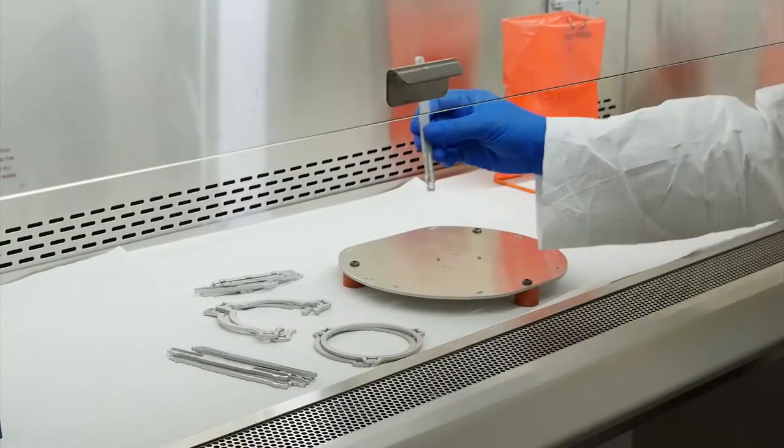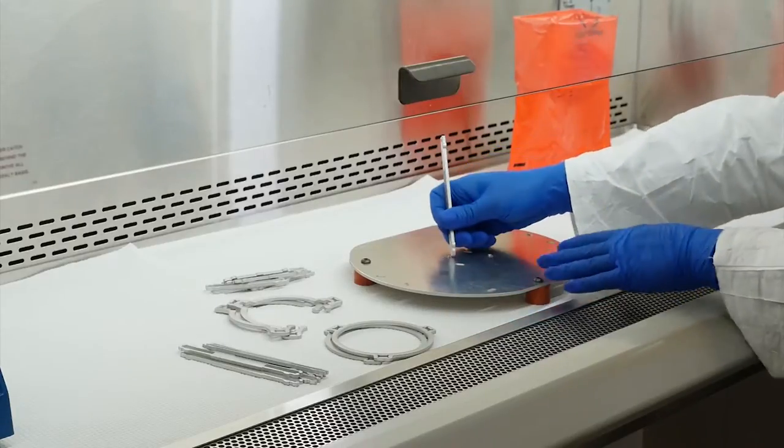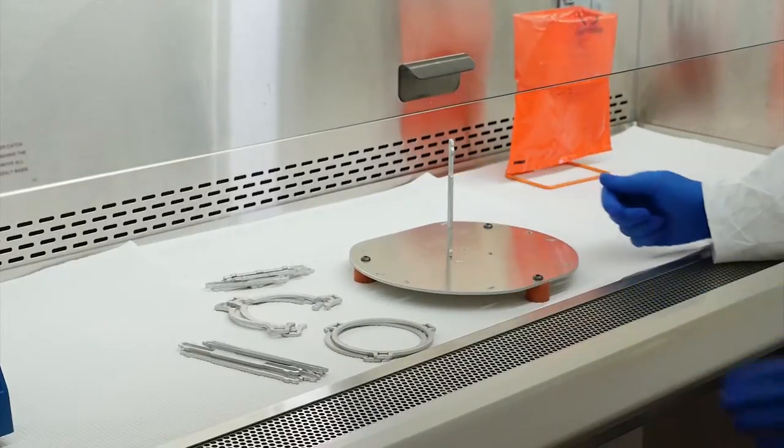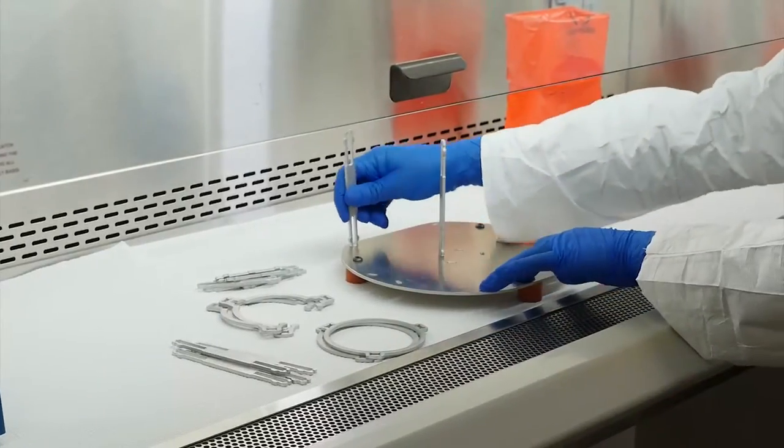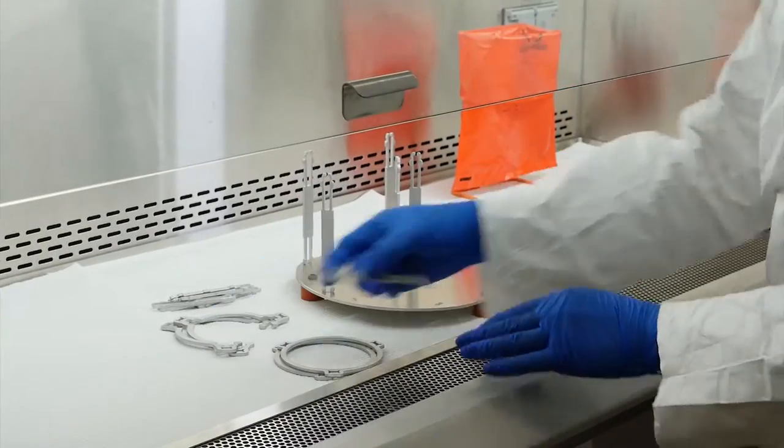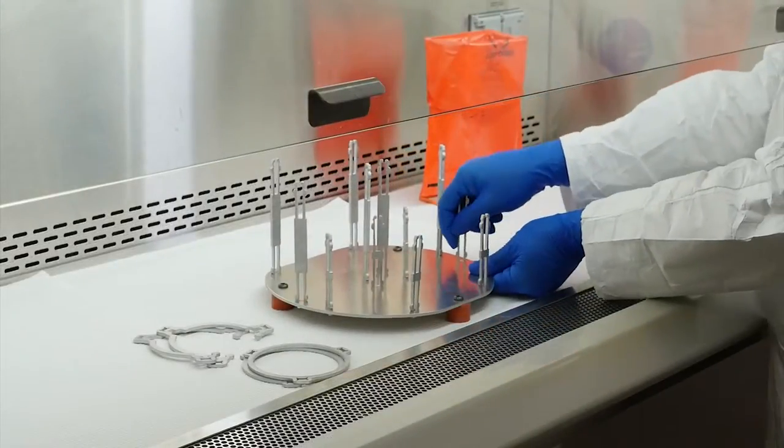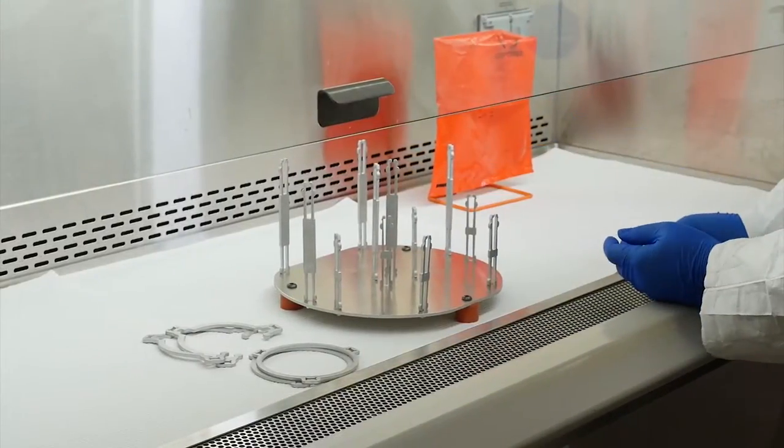To assemble the elution device stand, take a tall leg, squeeze it near the bottom, and insert it into one of the six slots near the back. Some slight rocking back and forth may be necessary to insert the leg. Repeat this step for the other five tall legs. Insert the six short legs into the remaining front slots.